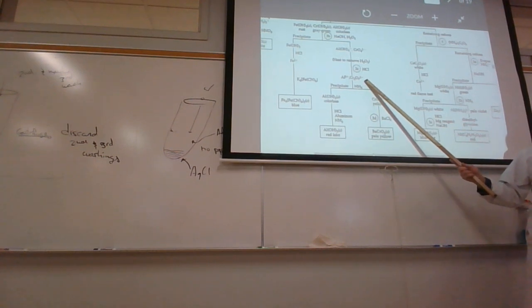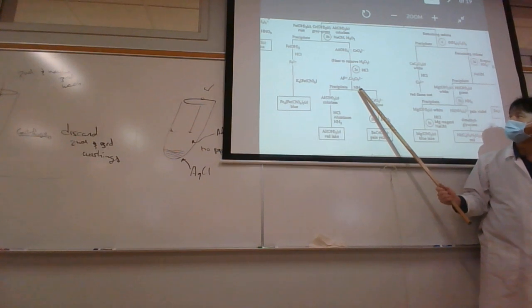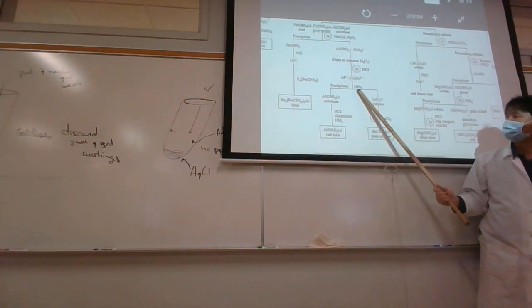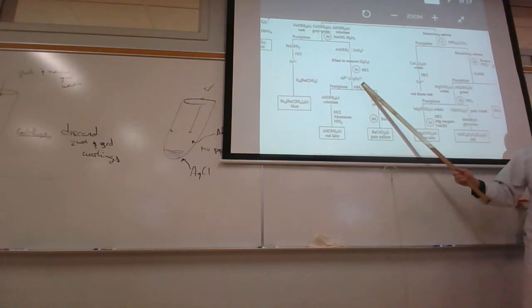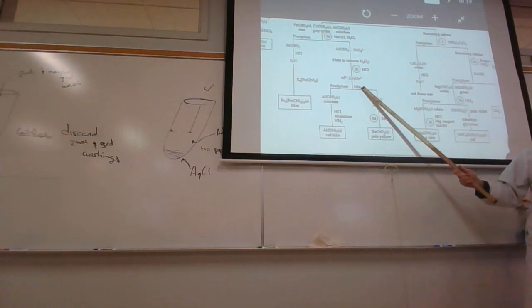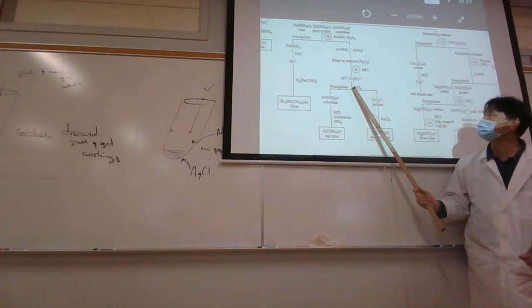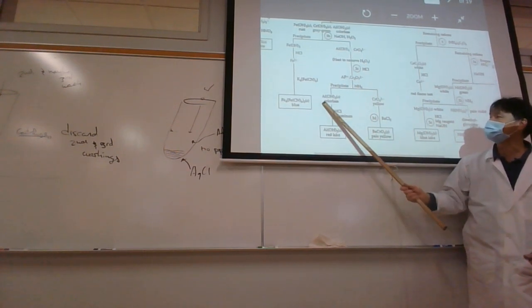One's enough. You don't want to add too much HCl because in the next step we've got to add ammonia. Ammonia needs to do something, but the first thing it's going to do is neutralize the HCl. Once the HCl is neutralized, then it can attack what? Well, the ammonia is going to precipitate out the aluminum again. So we're just going to use ammonia to precipitate out the aluminum.